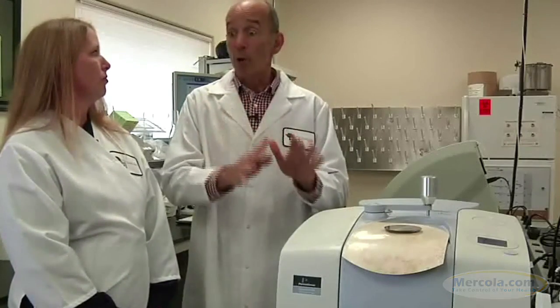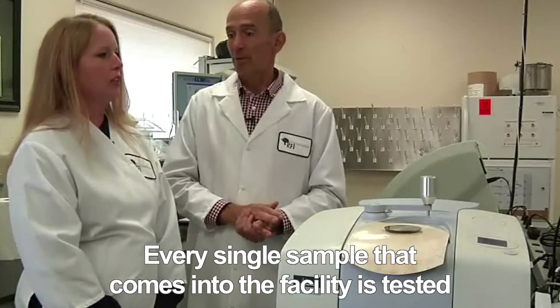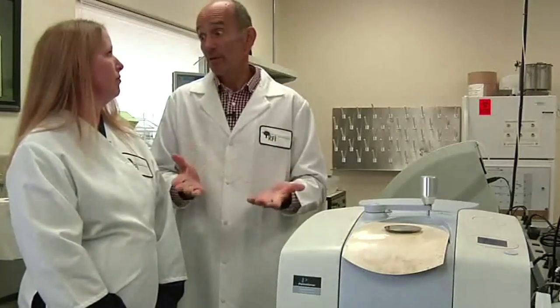This is not just done once, this is done at every single sample that comes into the facility, just like microbial testing. It's not a one-time deal, it's done on a regular, continuous basis. So that's why you have a job here, because you're Director of Quality Assurance. Yes.